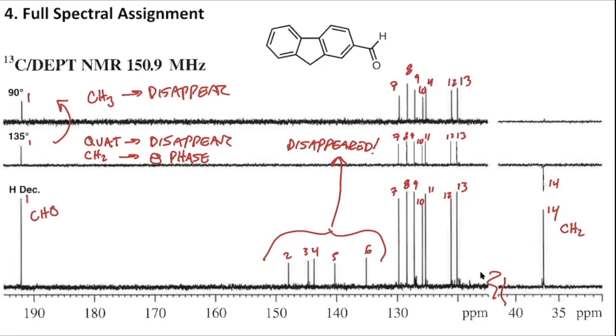And again, we can do a little sanity check: if we have this CH, emphasis on the H, there definitely has to be a hydrogen attached to that carbon, so that checks out for our aldehyde. And a lot of the rest of these on our molecule are aromatic with one aromatic proton off of them, so we're going to have a lot of different CH signals from our carbon NMR.